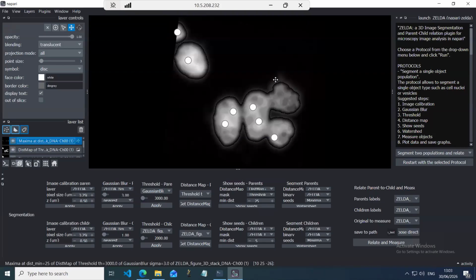Then there is one way to handle the point layer that we have here on top. So I will select this tool in order to highlight specific points, now shown in blue, and I can delete this point. Or eventually I can try to take this point here and just position it in the next cell that I would like to see segmented as an independent one.